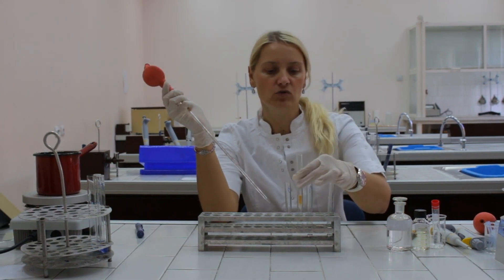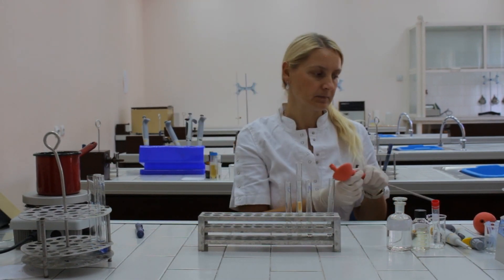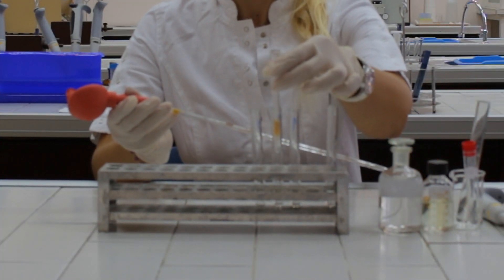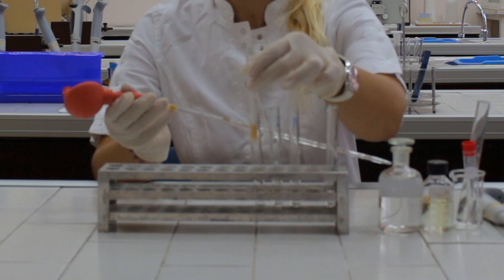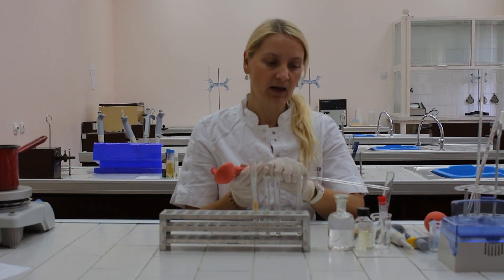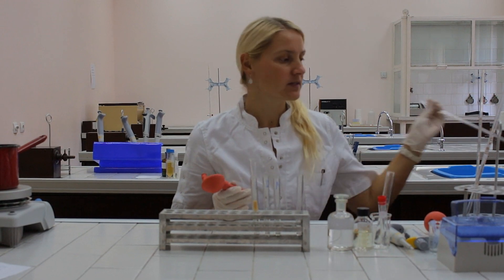Let the solution flow in again. Finally, transfer the chromatographic column to test tube number three and repeat the procedure. But now we have to pipet one milliliter of acetic acid.